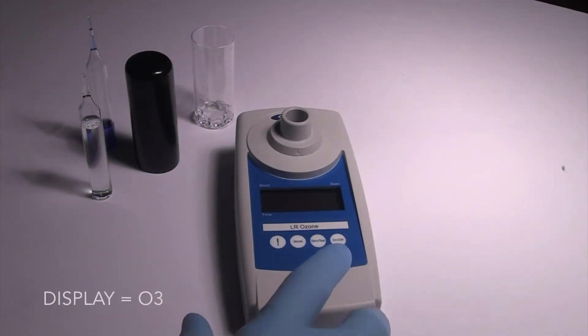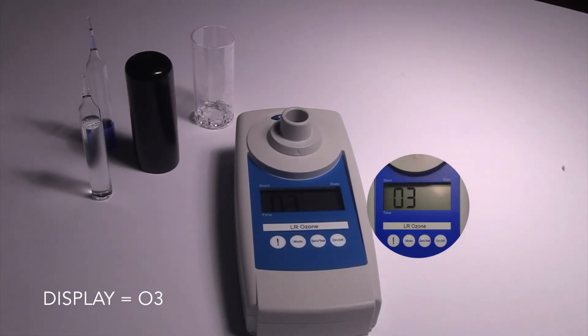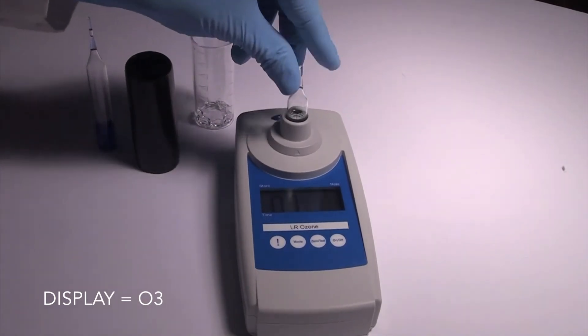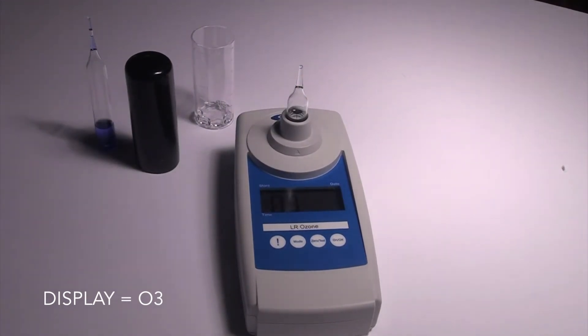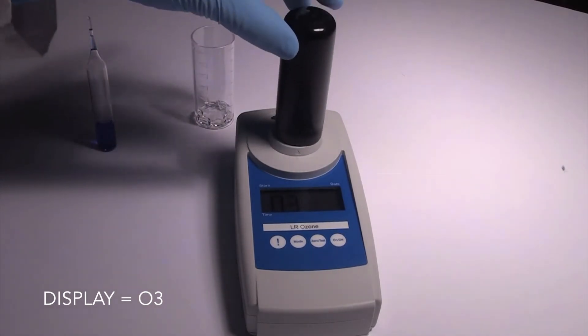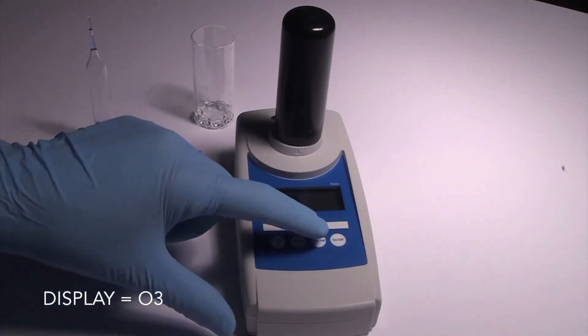To begin, zero the SAM. Press the ON-OFF key. The display will show O3 for ozone. Insert the zero ampoule flat end first into the sample cell compartment, making sure that it's fully seated. Place the light shield over the zero ampoule. Press the zero test key.